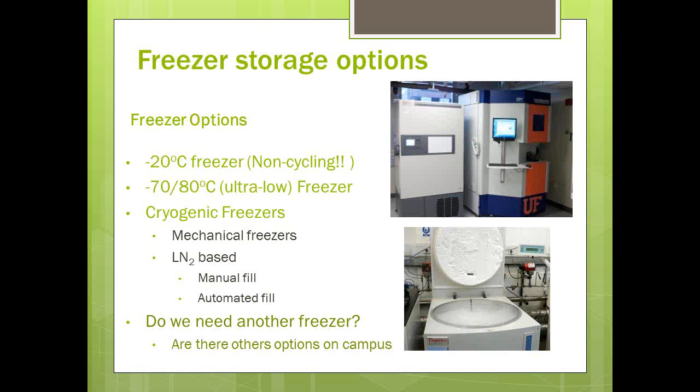I would suggest the CCTS. We have a very large freezer capacity, not unlimited, but nonetheless it is large, and we can accommodate a lot of samples. And so if your needs aren't large and you don't need a whole freezer, why don't you partner with somebody? The other advantage from the CCTS, and I'll show you some software solutions that we're using for storing samples, is that we have a very rigorous, robust inventory system that can track your samples.